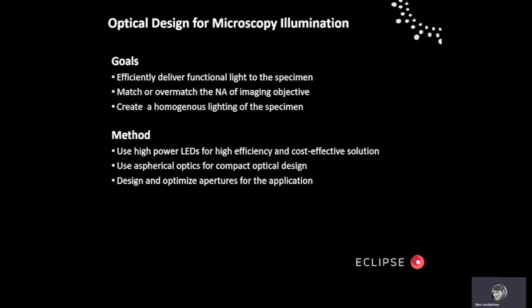Okay, so now I will talk a little bit about optical design for microscopy illumination. And this is a type of project that we do a lot. If you want to integrate a microscope into your product, then it doesn't really make sense to make your own microscope objective, but it does make sense to do your own illumination.